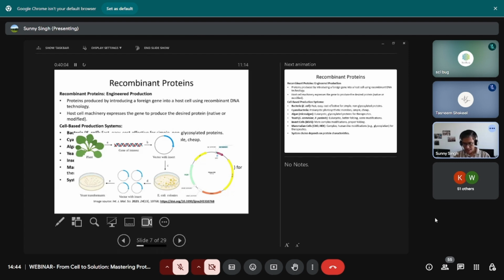After you plate it, you take the colonies, culture them again, and then extract out the plasmid. You know plasmid mini prep, right? You must have done plasmid mini prep or the Qiagen kit, Qiagen plasmid mini prep. Maybe you would have extracted plasmid DNA by setting up overnight cultures of E. coli, putting a toothpick or loop, wiggling it in the bacterial cell culture LB media, and then next day you are able to extract your plasmid DNA. So I suppose you might have done it.